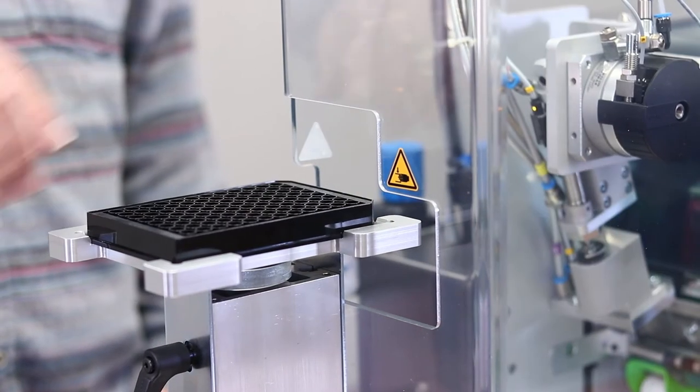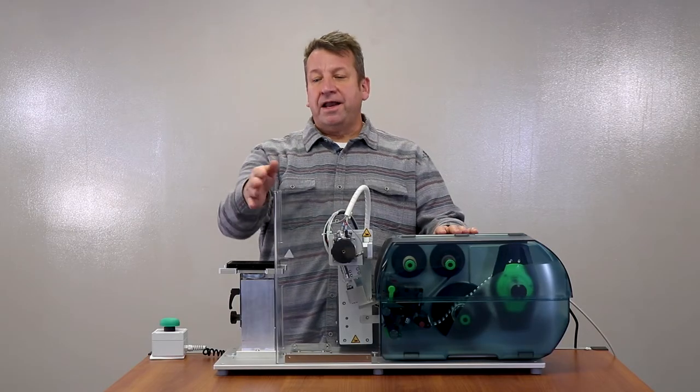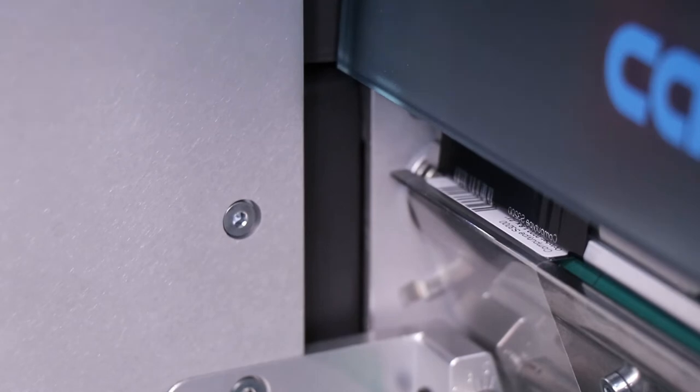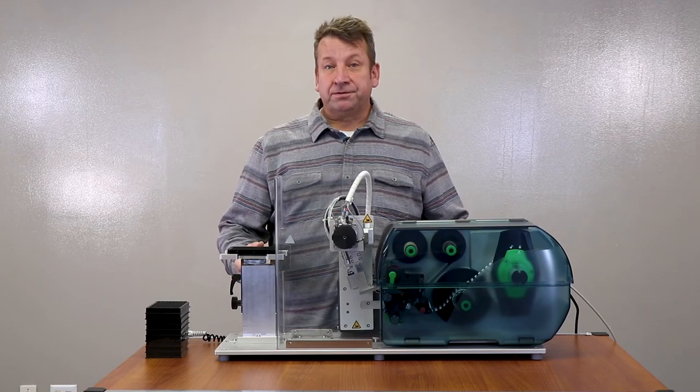It has a really safety-conscious design and despite that swinging applicator arm, it has this cover that helps eliminate pinch points. One of the really nice features about this applicator is that it uses the CAB Squix 600 dpi printer. With 600 dpi resolution you can print small text and 2D barcodes.